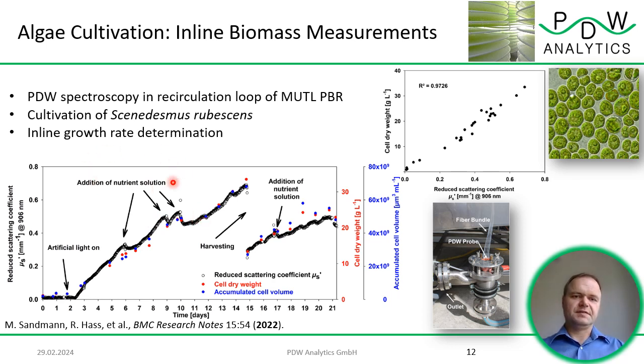And one can easily see effects like, for example, that the addition of nutrient solution actually lowers the slope, lowers the growth. A different way of adding nutrients would be useful here to have optimal growth of the cells.